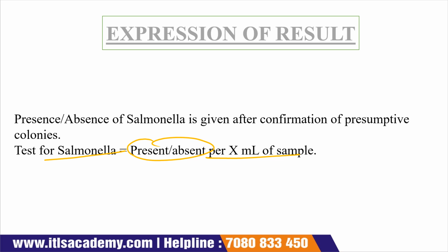So this is all about the detection of Salmonella by using culture media. I hope you will understand.